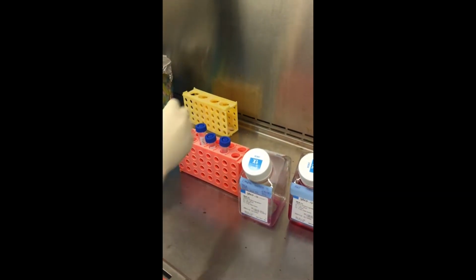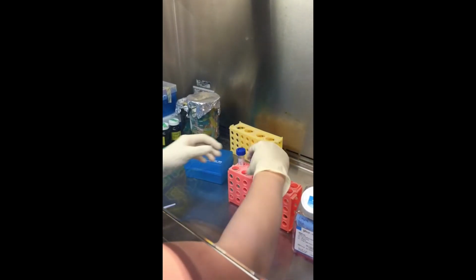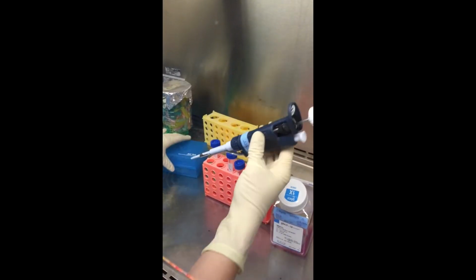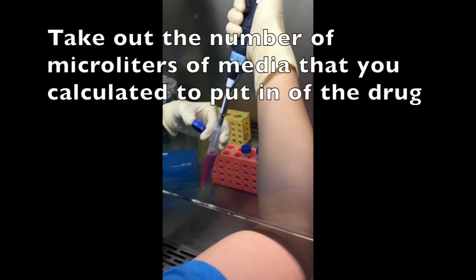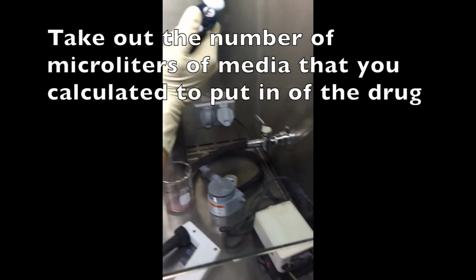Okay, so now the untreated one is complete because there's not going to be any drug in it. The 20 micromolar, remember I said I'm adding 16 microliters of drug. So the first thing you need to do is take out 16 microliters because we still want our total volume to be 8 milliliters.